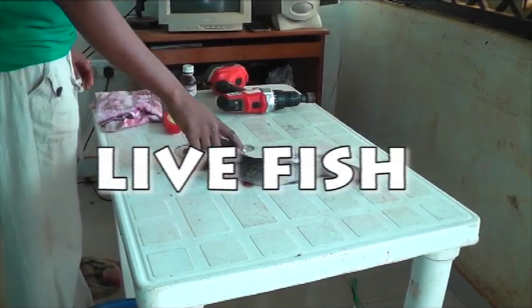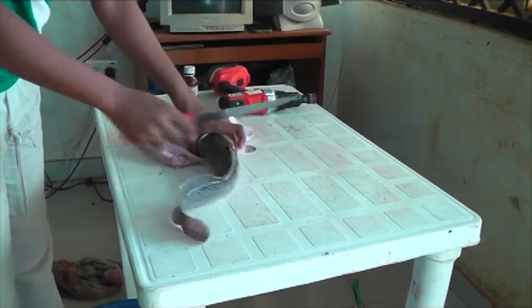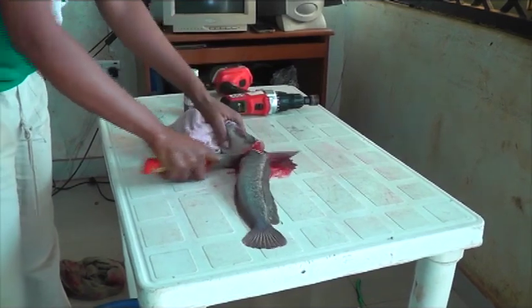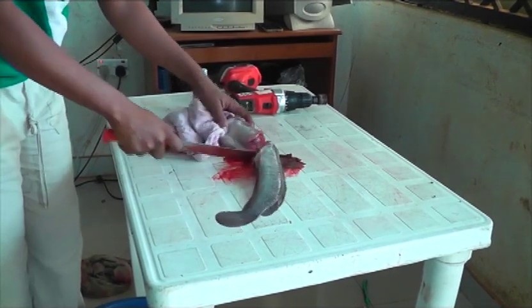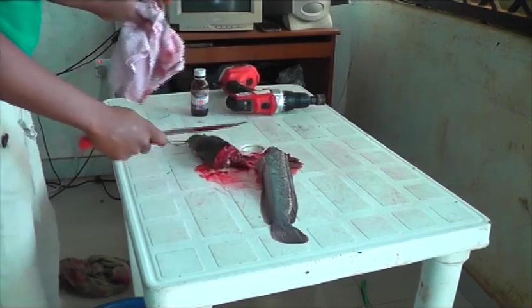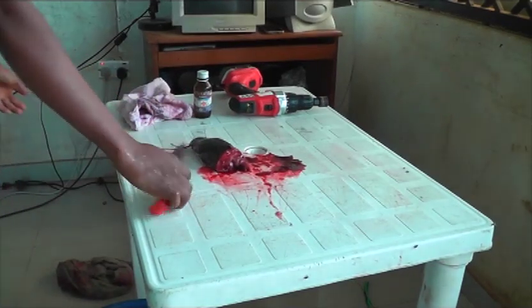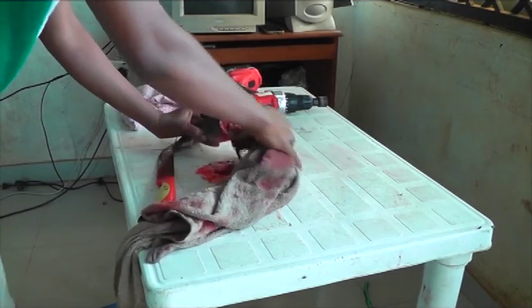The next step is to cut your fish into two to drain the blood. Drain and clean the fish very well, clean the blood properly.